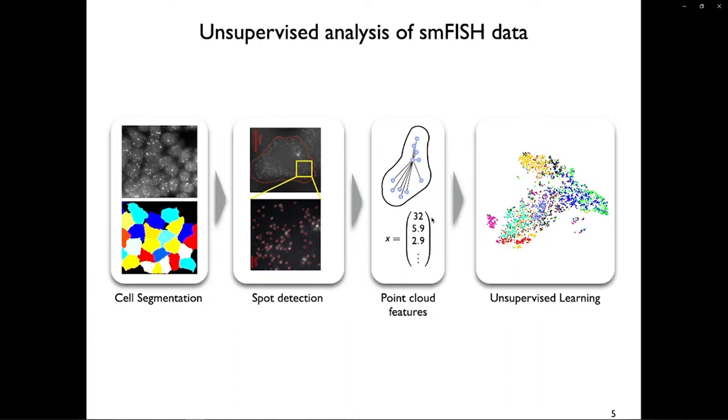If we are now in this unsupervised regime that we have just been talking about, what we would do, for instance, for exploratory analysis, is project this to a low-dimensional space using a UMAP or a t-SNE or even PCA, but normally we would go for more modern methods, of course. And then you get something like this, right? This is a plot where every point corresponds to one cell, and the particular location of the point corresponds to the localization pattern, and you would then explore and look at the corresponding images or the corresponding point distributions in order to make sense of that.